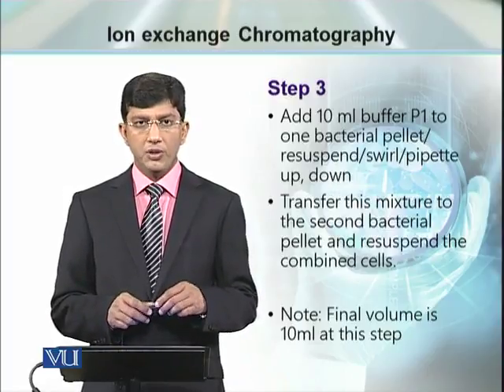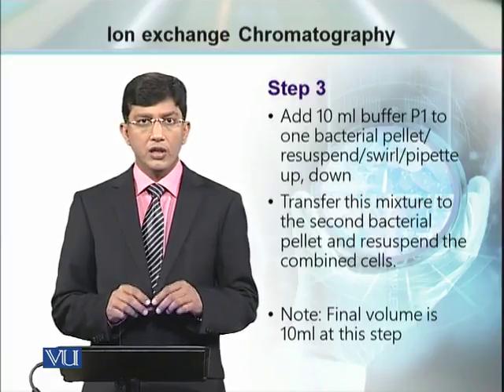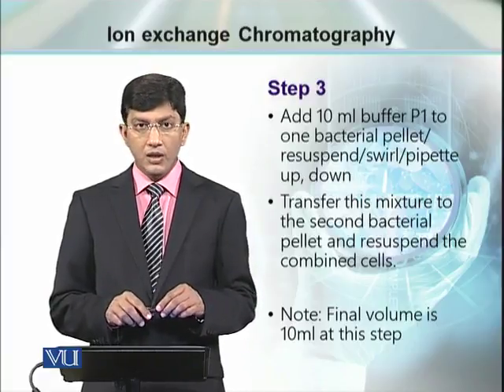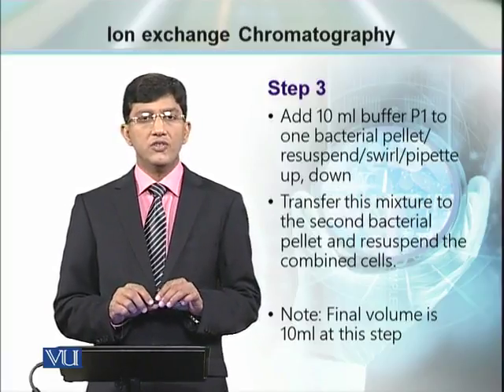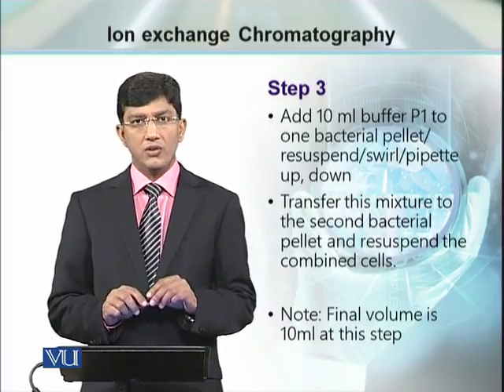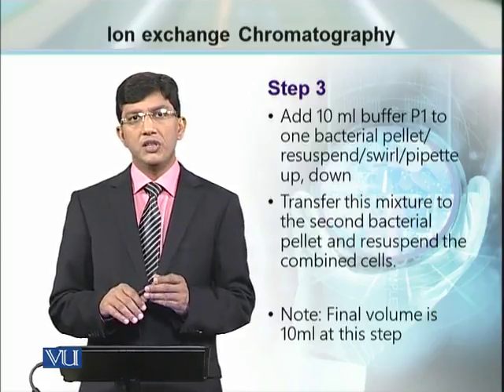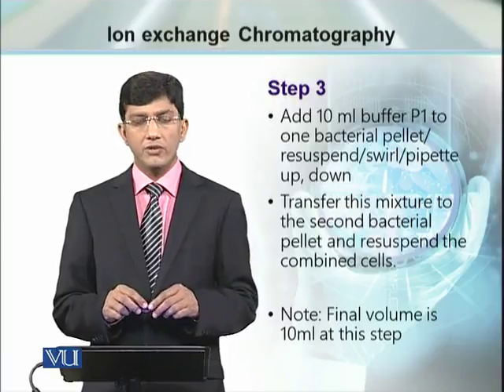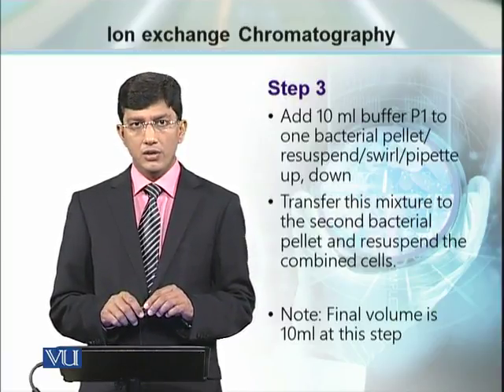Once the supernatant is discarded, the next step would be resuspending the bacterial cells in P1 buffer. The P1 buffer, which we already talked about its composition, is the resuspension buffer. We are going to use 10 milliliter volume to resuspend our bacterial sample. So after this step, all those bacteria which were earlier found in 500 milliliter volume are now found in 10 milliliter volume.